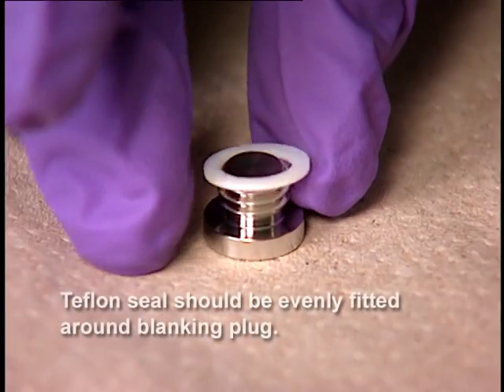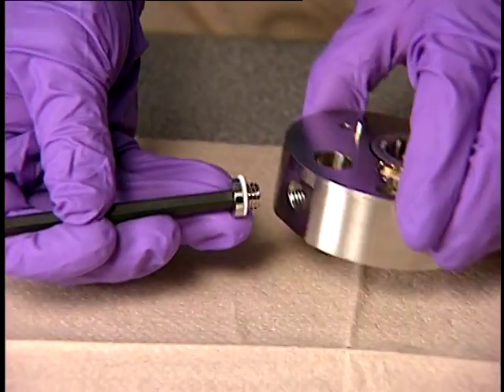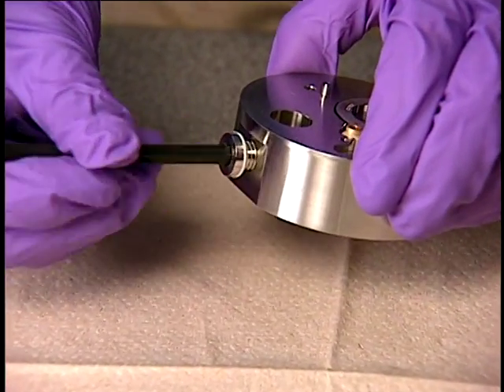Insert a new blanking plug seal onto the blanking plug and then insert them into the ion block. Tighten using the 6 mm Allen wrench.